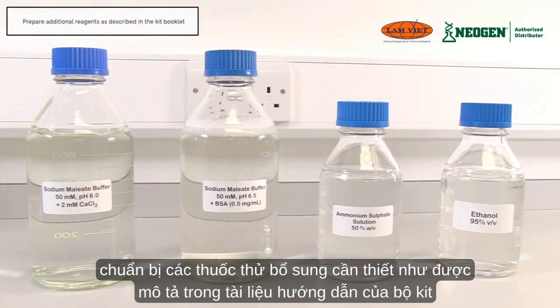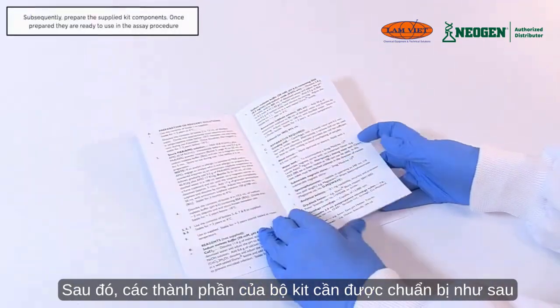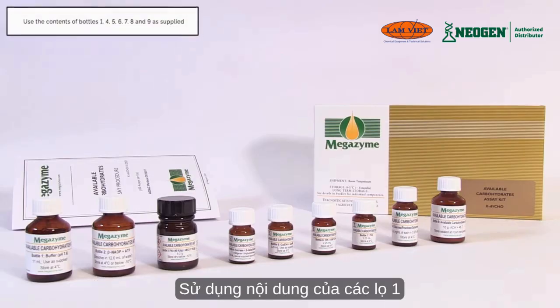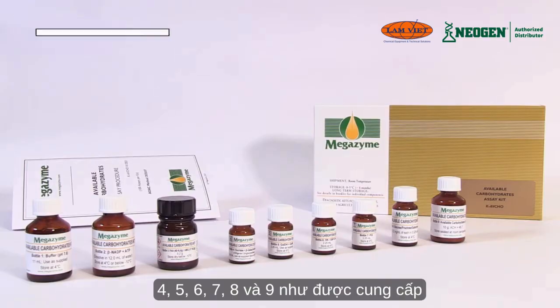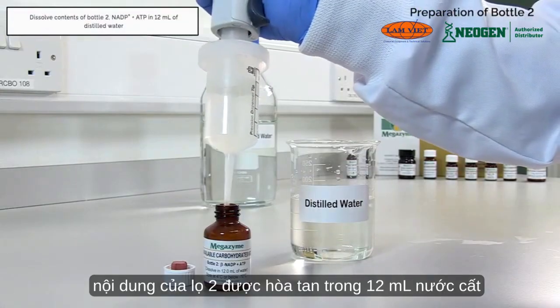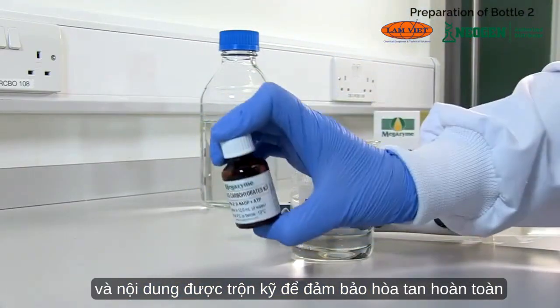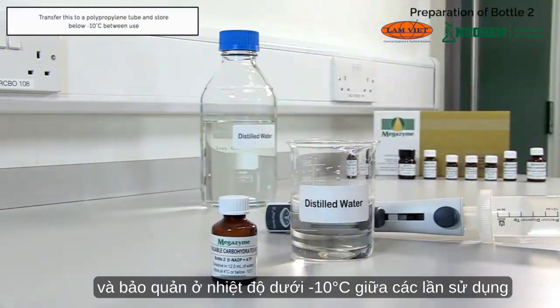Prior to sample analysis, prepare required additional reagents as described in the kit data booklet. Subsequently, the kit components should be prepared as described in the kit data booklet, and once prepared, they are ready for use in the assay procedure. Use the contents of bottles 1, 4, 5, 6, 7, 8 and 9 as supplied. The contents of bottle 2 are dissolved in 12 millilitres of distilled water. The bottle is capped and the contents are mixed thoroughly to ensure complete dissolution. Transfer this to a polypropylene tube and store below -10 degrees Celsius between use.